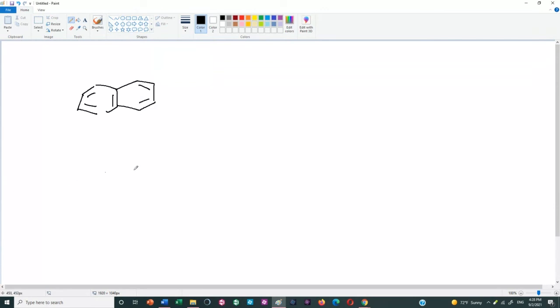And then the impurity looks like this. So you have 90% of this and 10% of impurity in your solid. Okay? So when you get a piece of a little solid crystal, if it's visible, right? It's some fraction of a millimeter in size.